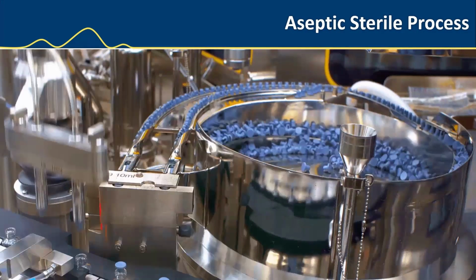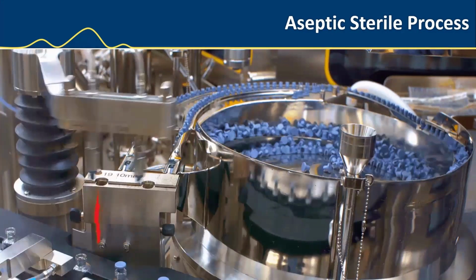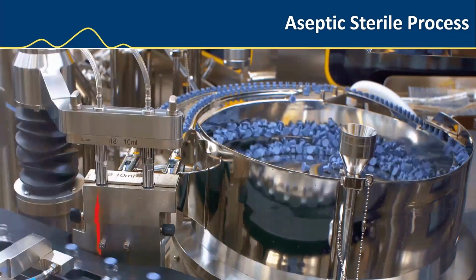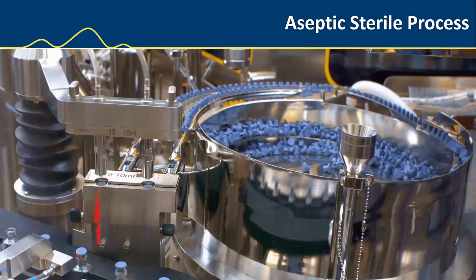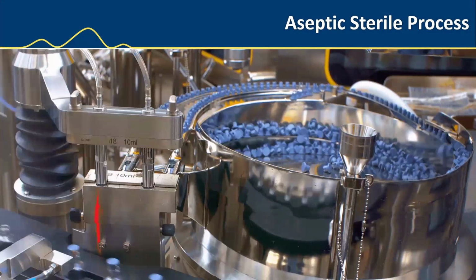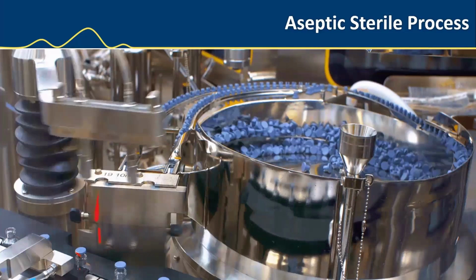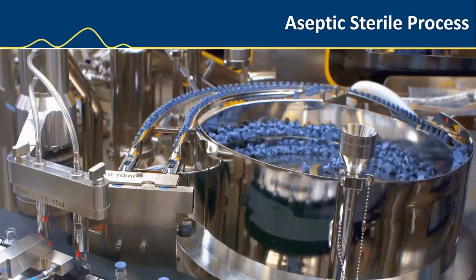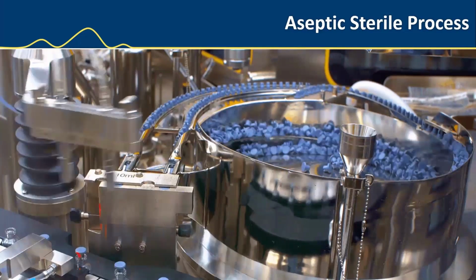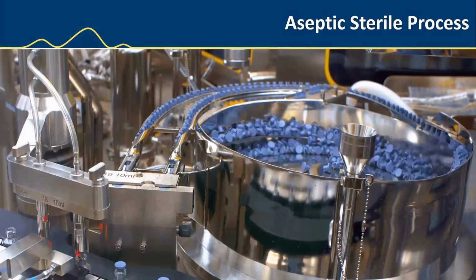So the expectation is continuous microbial monitoring in critical environments where container and product storage is at its highest risk. For instance, these containers are filled and capped in a sterile environment, typically ISO 5, grade A. The environment is monitored continuously during aseptic processing for any contamination using a combination of particle counters and air sampling, active air sampling, and settled plates. The goal of the operation is to prevent contamination of the product that may affect the quality and sterility of the parenteral product that's injected directly into the patient.